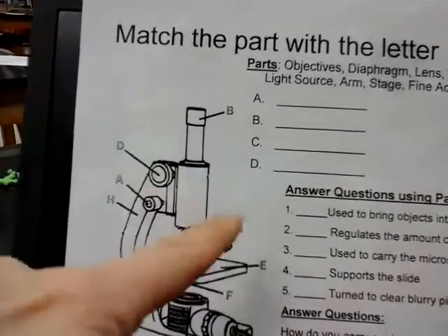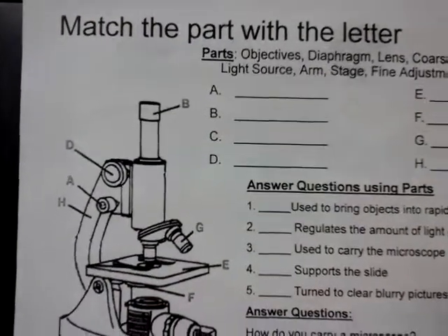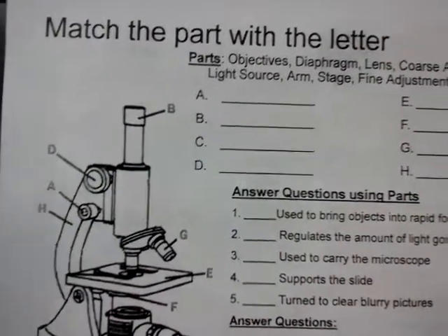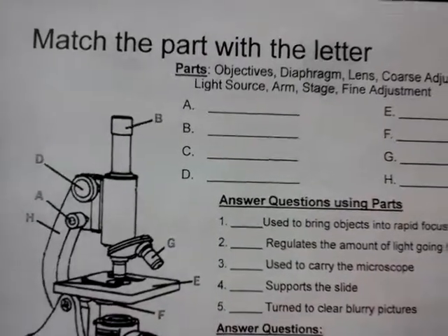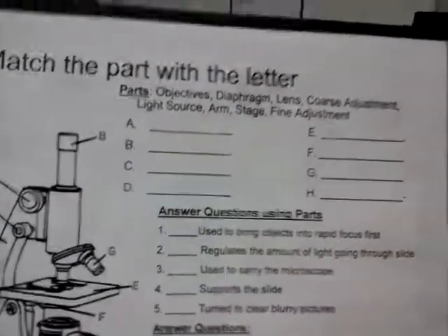So when you are on the red power, which we call low power, you're going to magnify things 40 times. So 10 from the lens and 4 from the objective. Okay, and that's what we call low power. And that's what you always start on. It's not going to magnify things a lot, but at least you can see the picture.